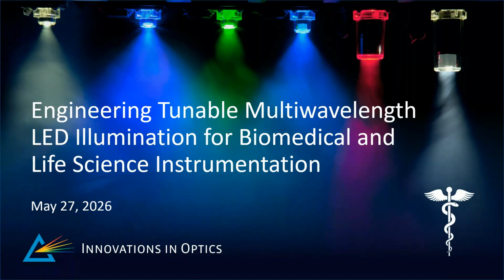At the same time, illumination technology itself has undergone a major transformation. Advances in LEDs, VCSELs, optical design, thermal management, and electronic control have created new opportunities for compact, highly controllable illumination systems that were simply not possible with conventional lamp-based approaches. So today, Tom and I will examine some of the engineering principles behind these systems and discuss how they are being applied across a wide range of biomedical and life science instruments.